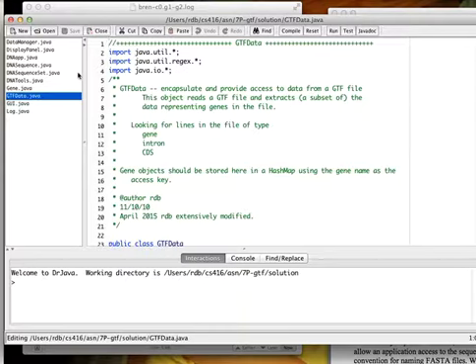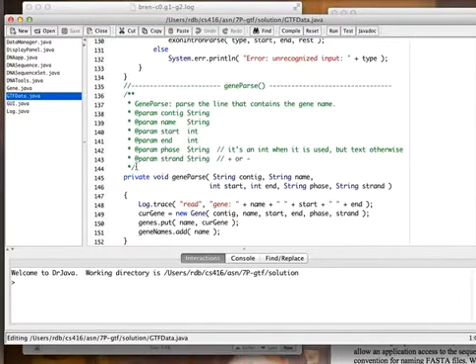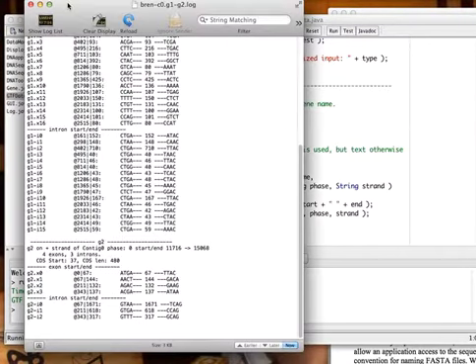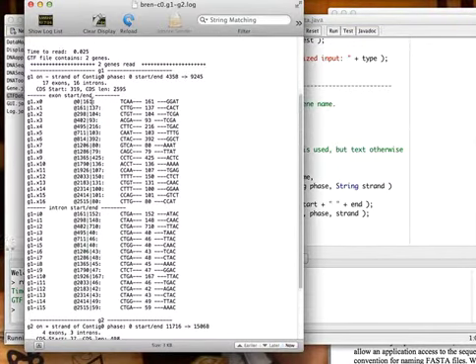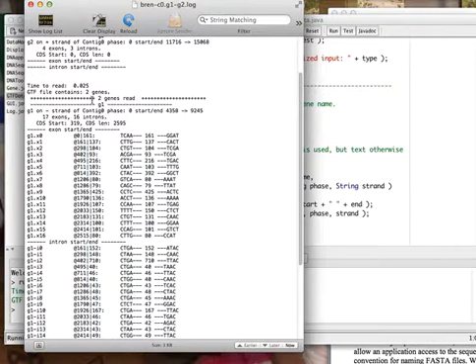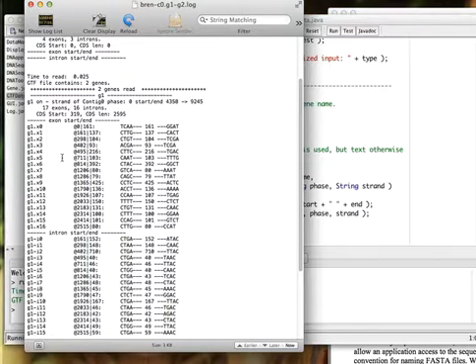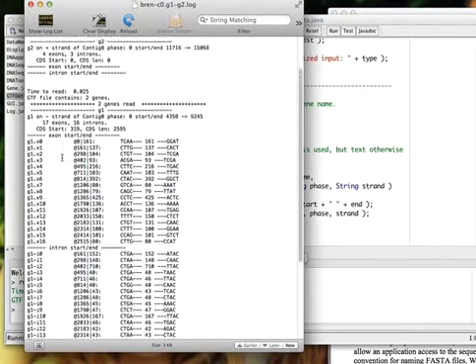and does not require the use of the graphics tool. So when you run this tool, and there's a default, and you can provide command line arguments, it will read the file, call mostly gene code, which has to build all this information, and then prints it out in a form without having to go through the graphics part.